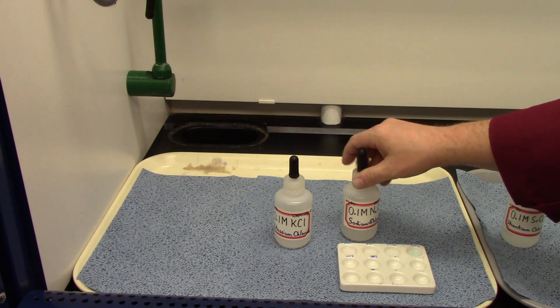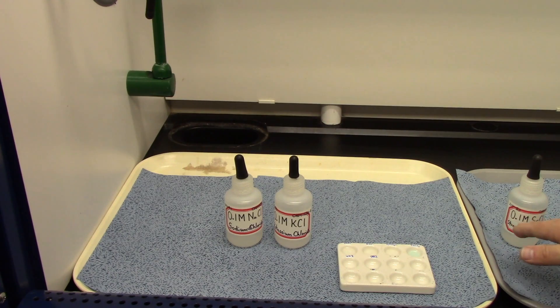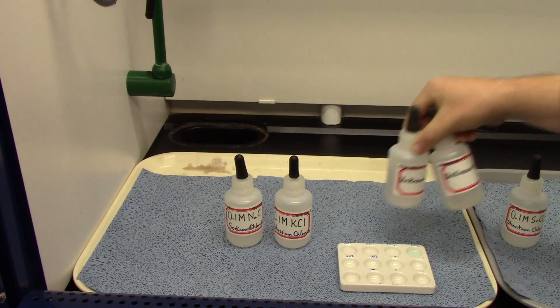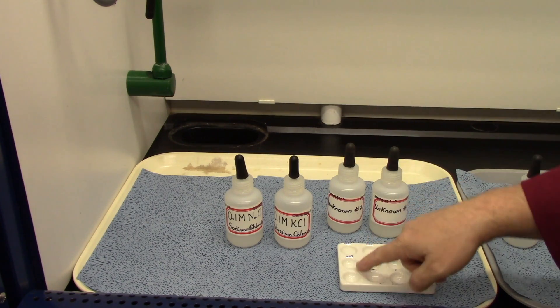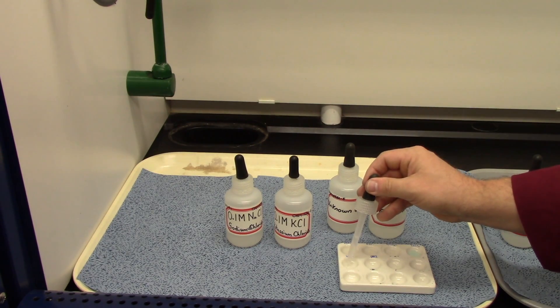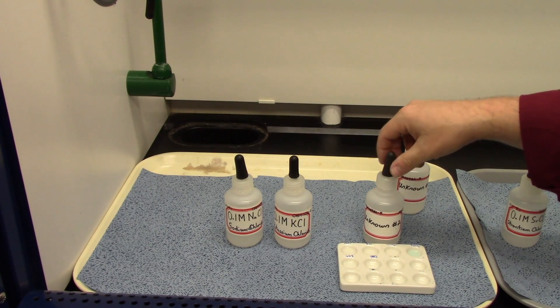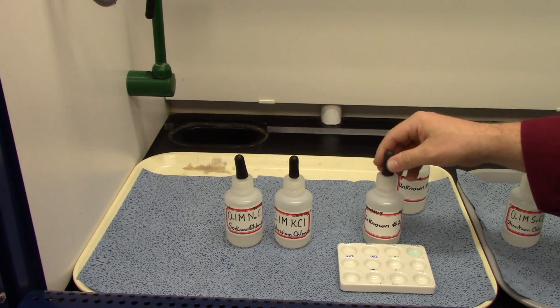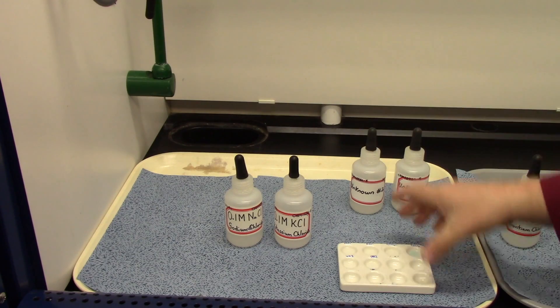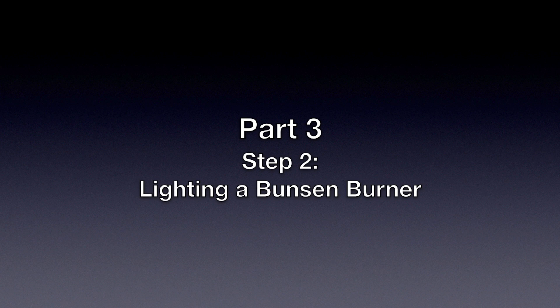Now we've got our known reagents into the proper wells. Next we're going to place the unknowns into the wells — the unknowns are clearly labeled unknown one and unknown two. The smart thing to do is to load your spot plate before doing the flame test. Don't turn your Bunsen burner on and then come over to get reagents — wait until you have all your reagents ready to go, then turn on your Bunsen burner. This is a fully loaded spot plate ready for the flame test.